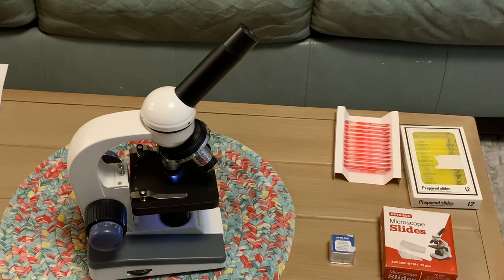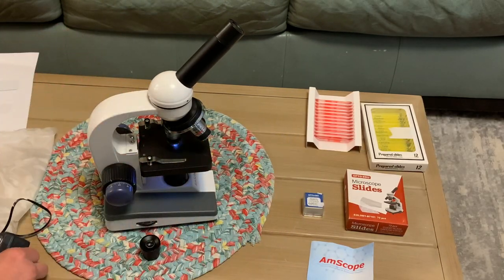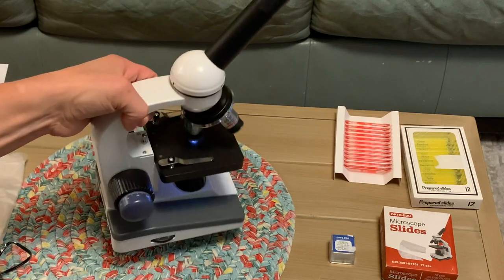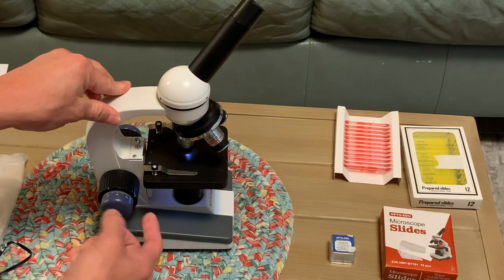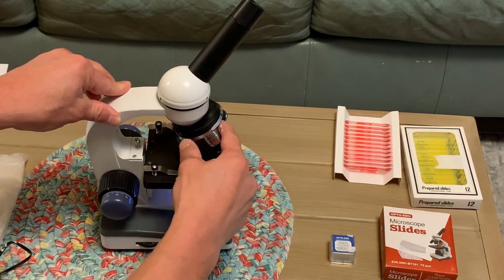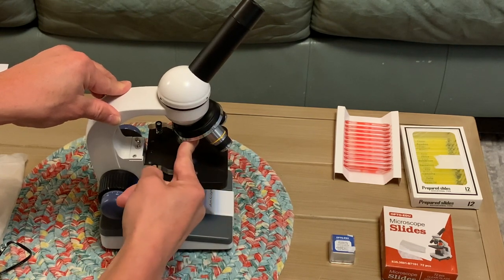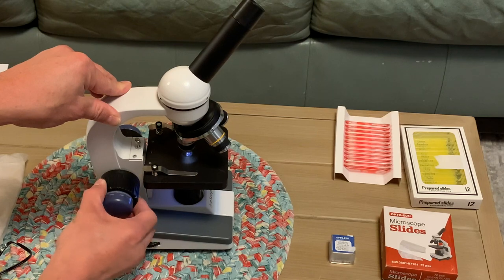Instead of using batteries you can also use this cord which plugs in right here — just remove the batteries if you're going to do that. The batteries go in on the bottom. You can break your slides if you go too close, so when you're using the 40x objective you don't want to get too close, but with something like the 4x you can go much closer.